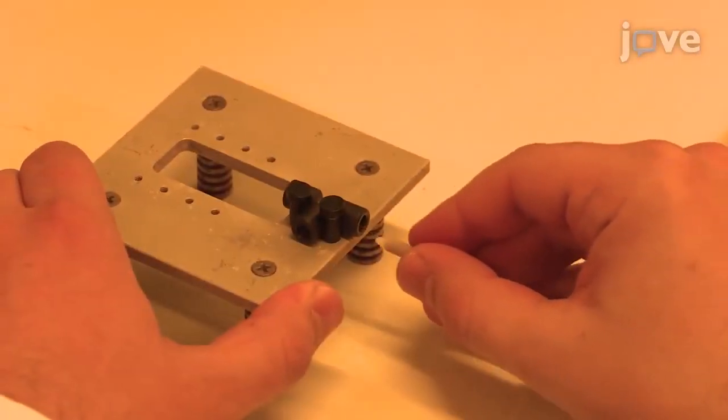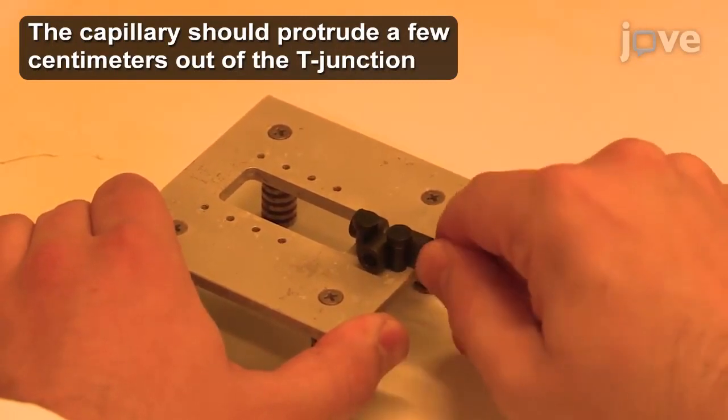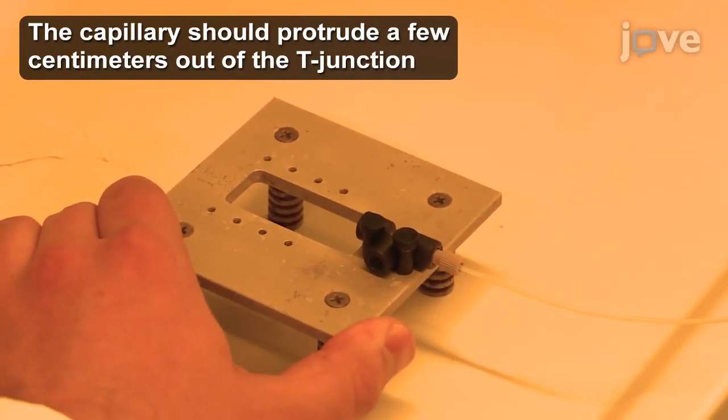Next, screw the PTFE tube to one of the opposing arms of a polyether ether-ketone T-junction for the 1/16th inches outer diameter tube, mounted on a small metal table.